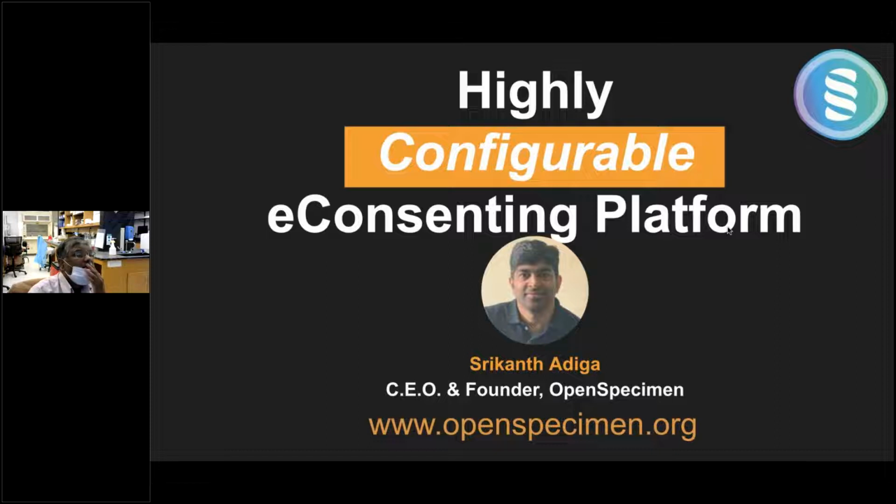So let me get started. Hi, I'm Srikanth Adiga. I'm the CEO of OpenSpecimen. Today, I'm going to talk about the eConsenting platform that we developed in the last 1 year.